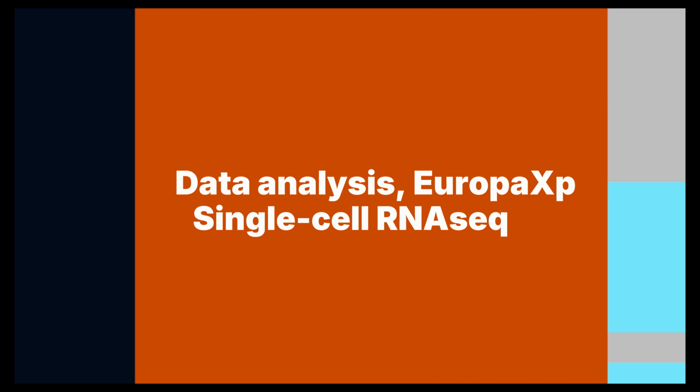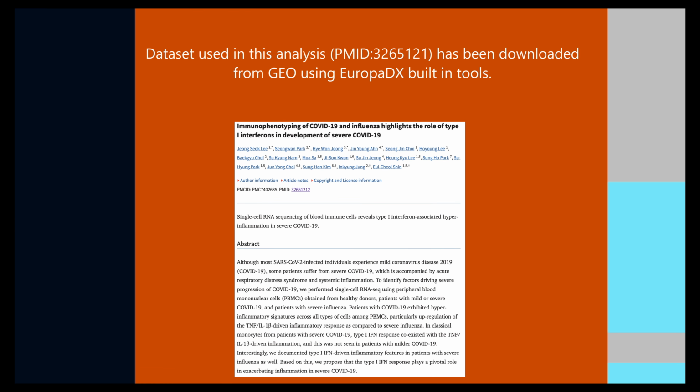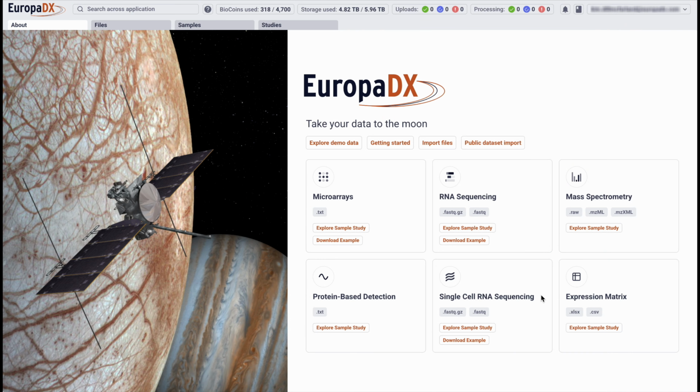Welcome to the Europa Data Explorer single-cell RNA-Seq analysis. These data come from a study on COVID-19 and flu. You can download them directly in Europa using our GEO integration.